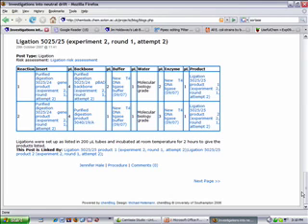And the reason why it worked was because she used a different brand of tubes. Is that true? Yep. No, it's absolutely true. She's been struggling because if you know anything about getting DNA into bacterial cells, we do what's called a heat shock. So you basically heat the cells for a very specified amount of time to a very specified temperature. And the width of the plastic and the shape of the plastic tube makes a huge difference. And I simply hadn't realised they were using different tubes.